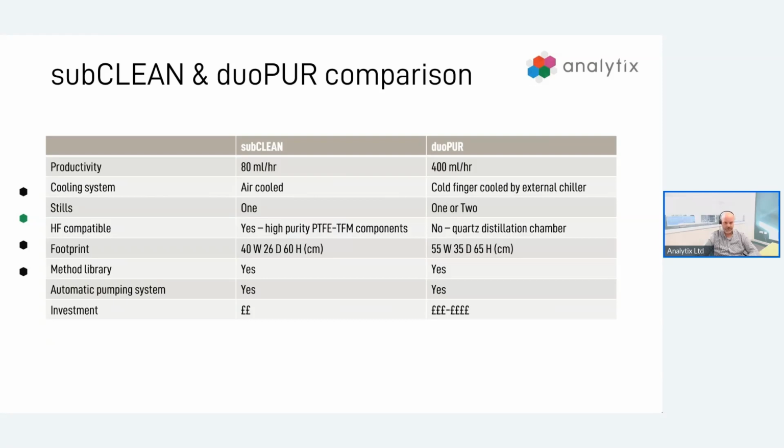So we've had a look at the purity of these reagents and what they can do in terms of the blank and how they affect it. But also we need to consider any errors that are occurring during the reagent addition. Now, this is something that typically hasn't really been looked at too much in the past, but it is a part of the process that is quite often tedious and unpleasant. Anyone that's done this, it is a manual step. Several drawbacks associated with it, because when you are adding acid into the digestion vials, there are safety concerns, obviously, because users are exposed to acid vapors, even when done in a fume cupboard.